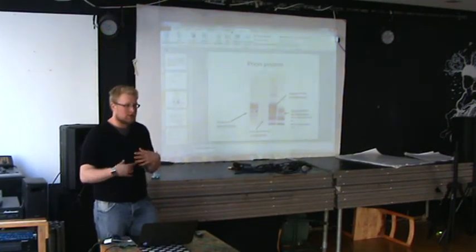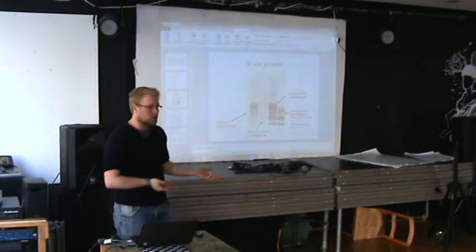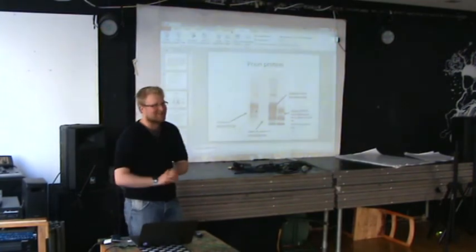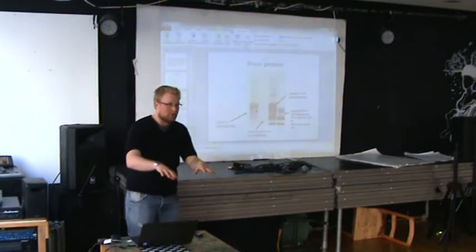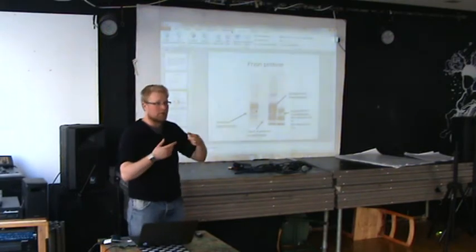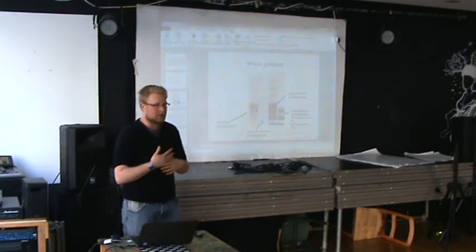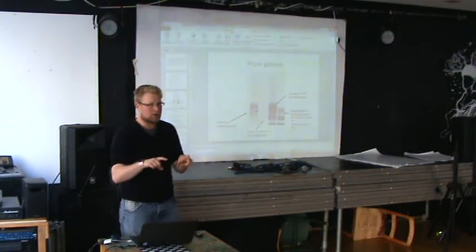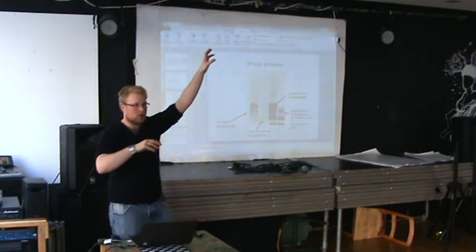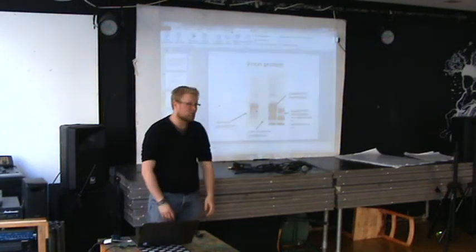You treat your different cell lines with certain things, or you put them in different conditions. You can knock out proteins and see what the effect is. I was trying to keep it somewhat basic, but yeah, you can upregulate proteins, downregulate proteins, and then see other effects. So you would basically show that your protein is upregulated, and then take that block, because if you can imagine, that piece of paper has all your proteins on it. Then you would wash off your fluorescent antibody, and then put on another antibody directed towards a different protein, and show that when I upregulate this protein, it actually affects another one. And you'd show that this one's higher, and then also this other one's higher, or this one's a bit lower, or something like that. So that's really what you're trying to do.